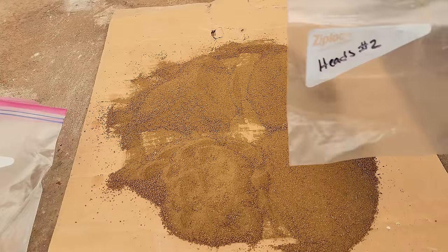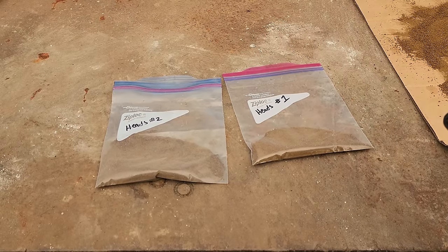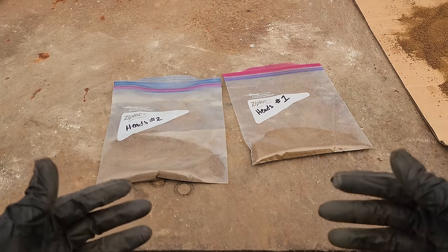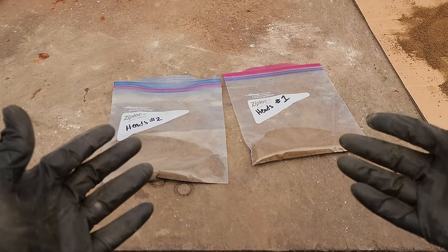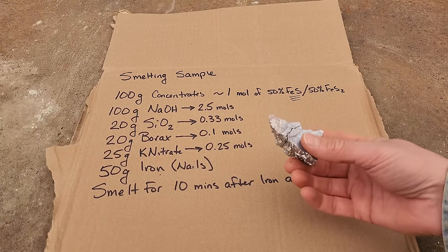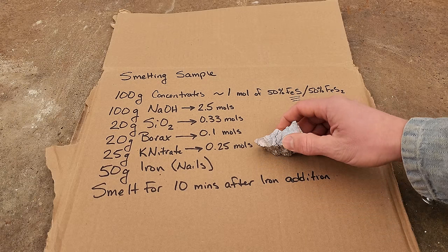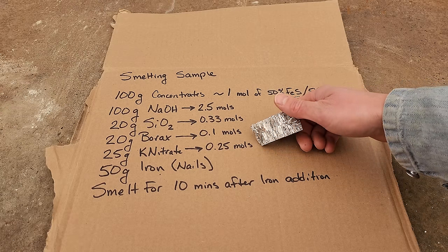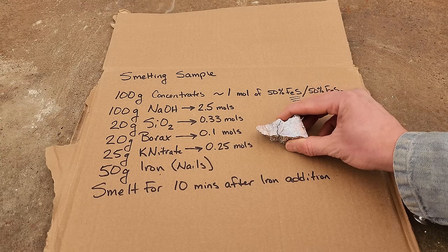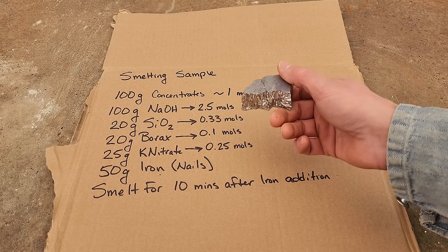I'm going to do the same thing over here with this pile on heads number two. These two are going to tell us how much gold and silver we have in the material before it's smelted, and that is going to be our baseline for how much gold we can recover and how much gold we lose in our slag. Then we can figure out what our percent recovery was. What I actually want to test today is the addition of a collector metal. In the past I've used lead — this is bismuth. I want to know how much collector metal we actually need to recover 99% of our precious metals. I did a test a couple of weeks ago where I re-smelted some of my tailings and I didn't get any metal collected at the bottom of the cone. I should have added collector metal but I don't know how much to add, and that's what I want to test today.